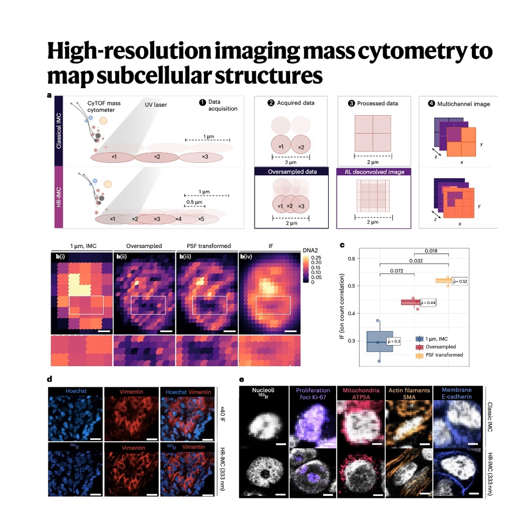Correct. The researchers used PSF-based deconvolution, specifically an algorithm called Richardson-Lucy, which is really robust against the kind of noise you find in IMC data. But they couldn't just use a standard PSF, could they? No, because IMC is destructive and it overlaps. This meant they needed a completely custom PSF. So they had to invent a completely new type of deblurring software just for this machine because they were intentionally destroying the sample. Essentially, yes.